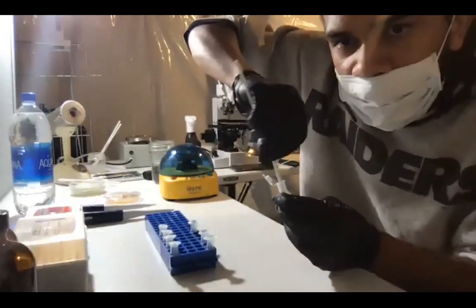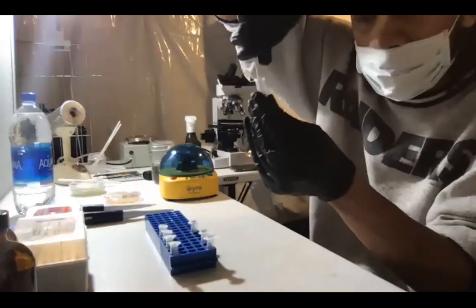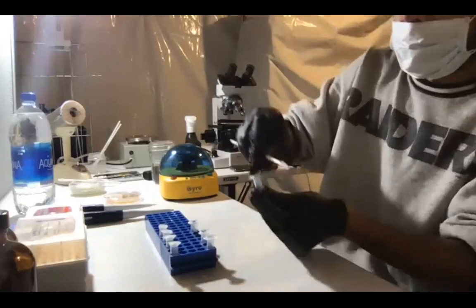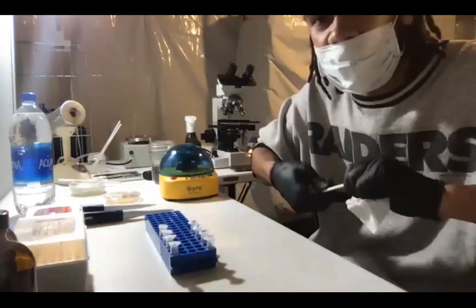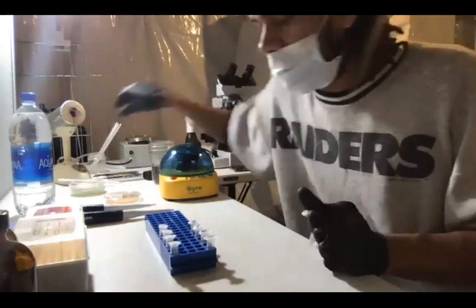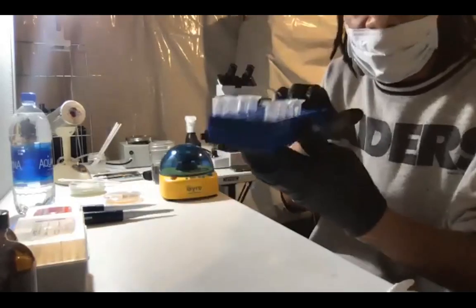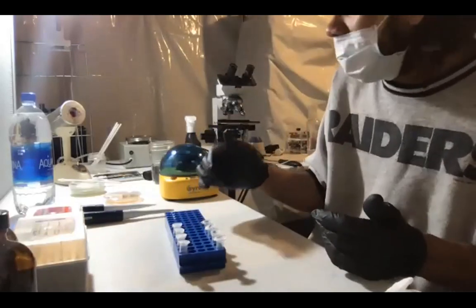What are you putting where for 10 minutes? I'm going to put these tubes with the mycelium in the extraction solution onto some source of heat that can get up to 95 Celsius for 10 minutes. In a standard laboratory, you'll have a heat block that's specifically for heating up these centrifuge tubes. It kind of looks like this, except it's metal. You can stick your tubes in there and it'll heat them up. I don't have one of those.